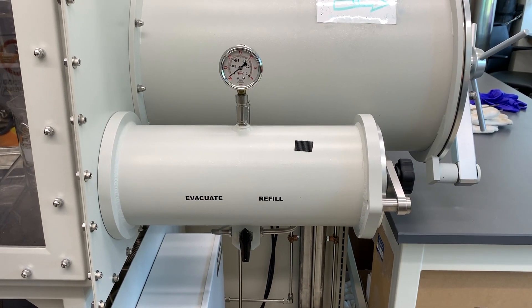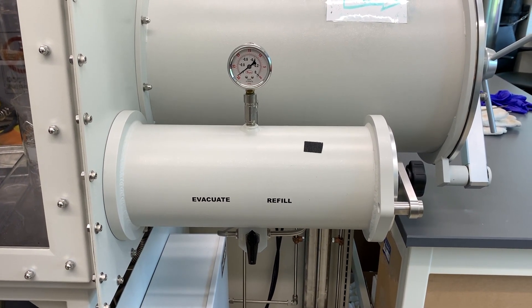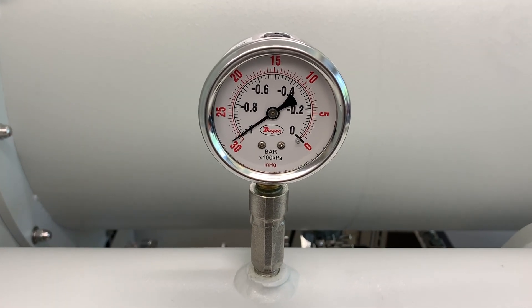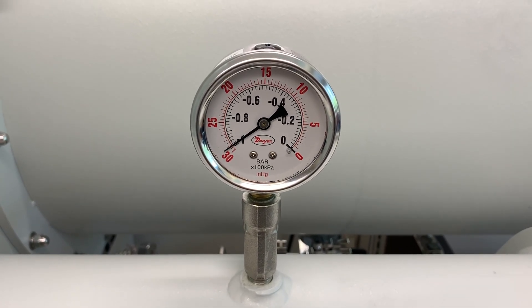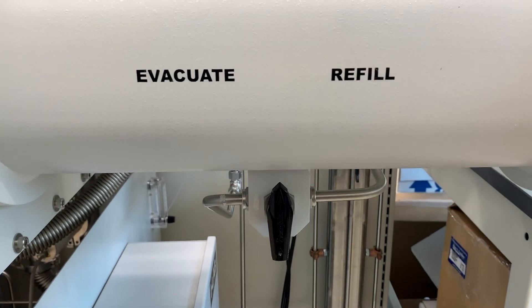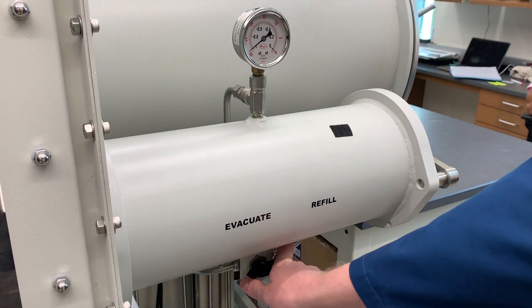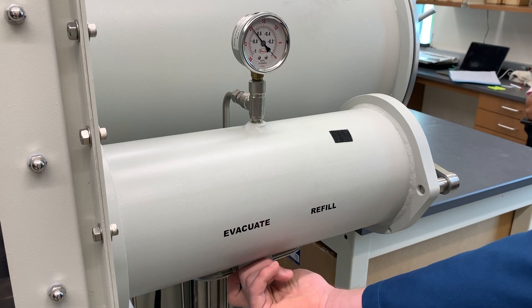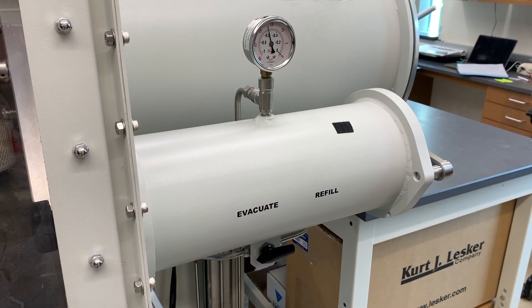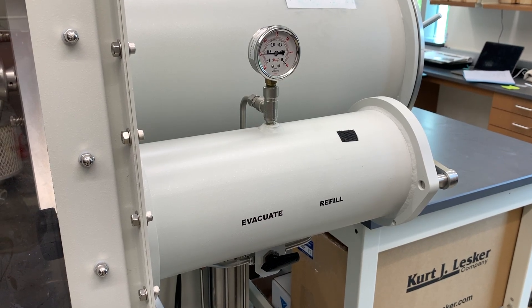When you come into lab, you'll commonly find the antechamber looking like this: the gauge indicates it's under vacuum and the black valve is positioned vertically. In this position, the valve is neither open to vacuum nor open to nitrogen — the antechamber is a sealed vessel from both the inside of the glove box and the outside. Moving towards refill brings nitrogen gas in through the stainless steel tubing that comes straight from the main glove box. Moving the valve toward evacuate opens the antechamber to the vacuum pump through some straight and flexible stainless steel tubing.